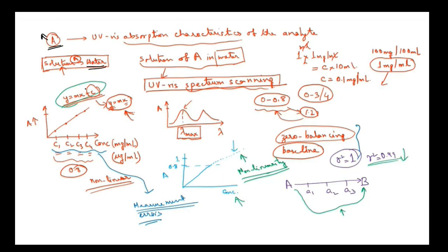Why? This is because most of the analytes which are biologically active are soluble in water. Hence, we are considering that the analyte A is soluble in water.